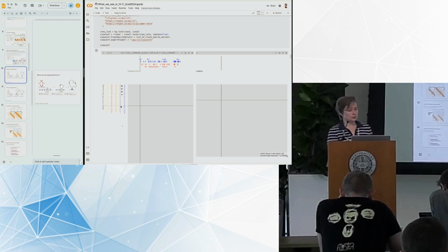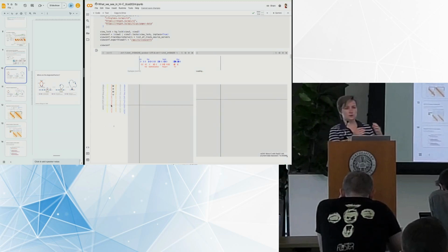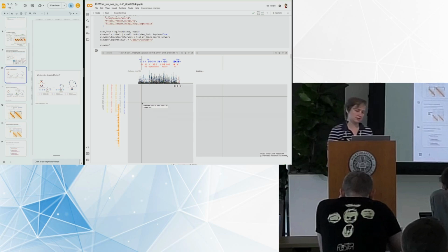And I added for you the ChIP-seq for CTCF, the factor which is responsible for stop points of extrusion, and I added a bunch of different histone modifications. So it might be loading slowly, but after some time you will see that there is indeed a one-dimensional track.